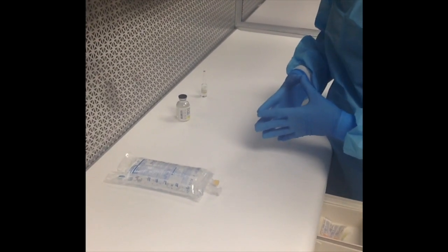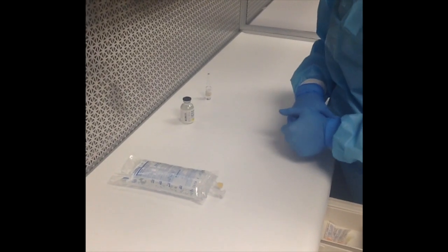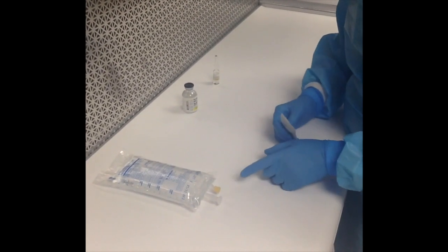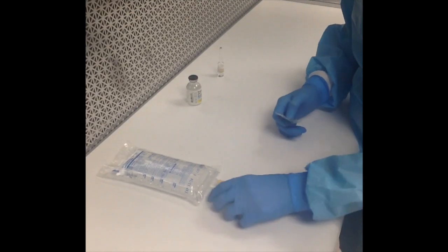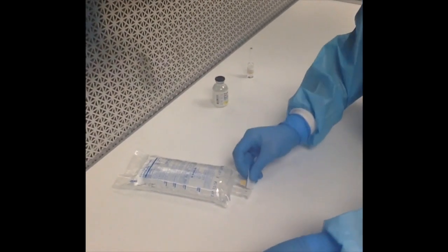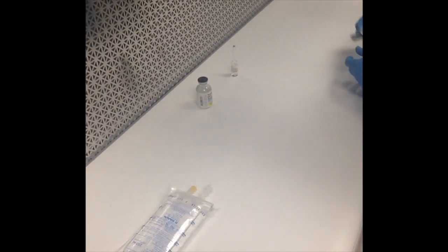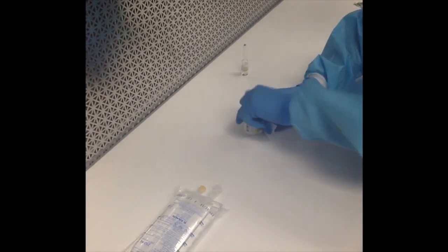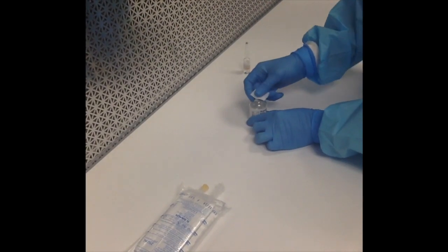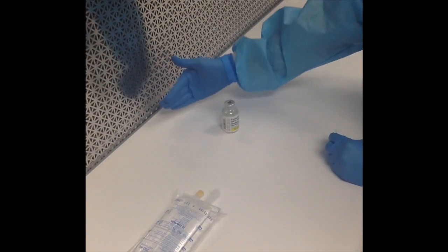Before we start compounding, I want to point out a couple of key points on our products — specifically critical sites. On the bag, our critical site is where the needle is going to go in. I'm going to alcohol that site so it's sterile, and I need the air to be hitting that site. With our vial, the critical area is the rubber stopper — that's where the needle will go in, so that's also our critical site. The air needs to be hitting it, making sure nothing is blocking the air flow.